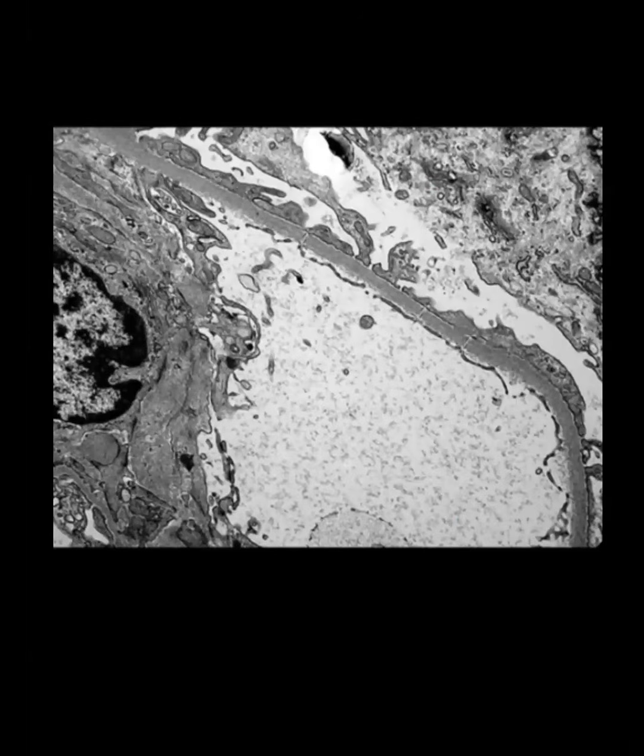You should be seeing the basement membrane. You know that the normal thickness of the basement membrane is roughly 280 to 450. It goes to 600 in case of membranous nephropathy, and it goes to 800 especially in diabetes.